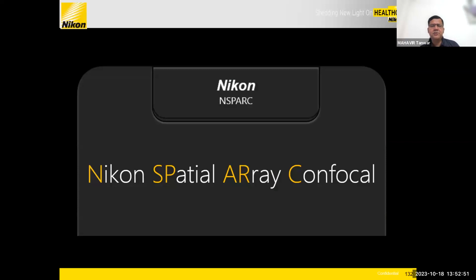Now, another technology, which is getting in these days. So SIMs are getting out from the market, and what new is coming? As I said, confocal based super resolution, meaning the user wants no restriction on the sample thickness. They want, okay, I should be able to use thick samples also, but I need the same resolution. So now the confocal super resolutions have come in the market.